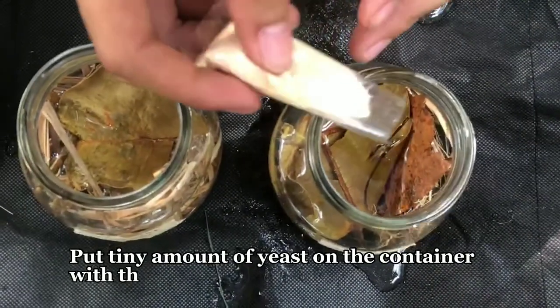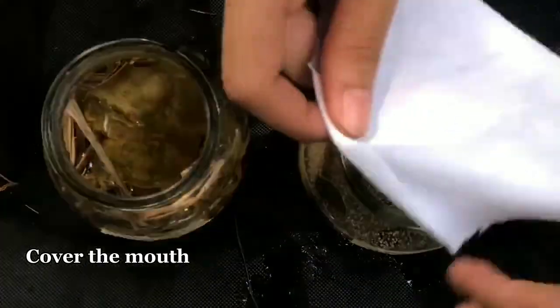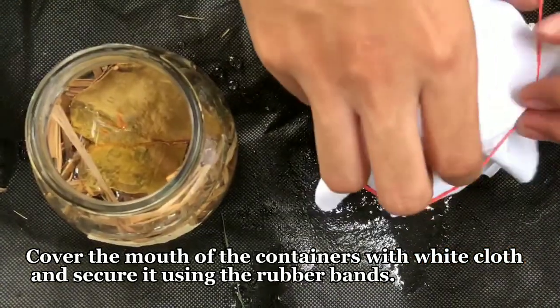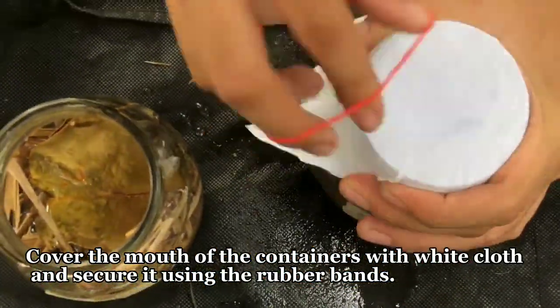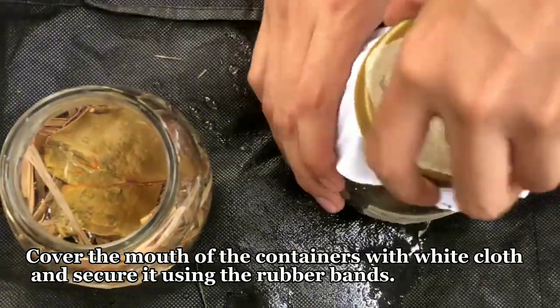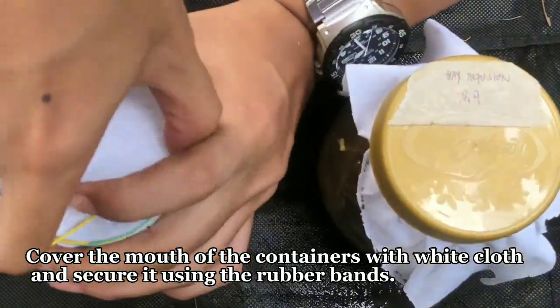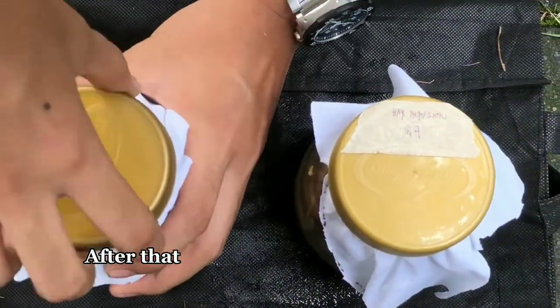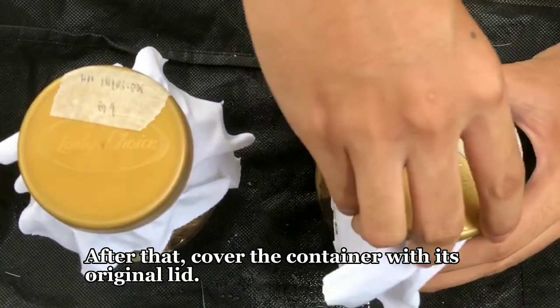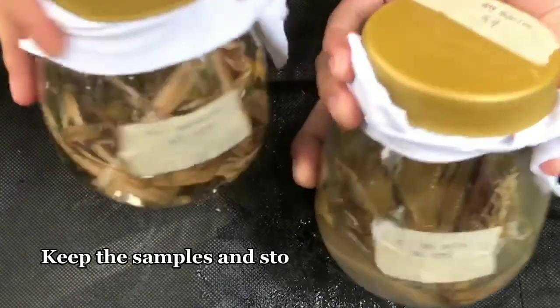Put a tiny amount of yeast on the container labeled 'with yeast.' Cover the opening of the containers with white cloth and secure it using rubber bands. After that, cover the container with its original lid.